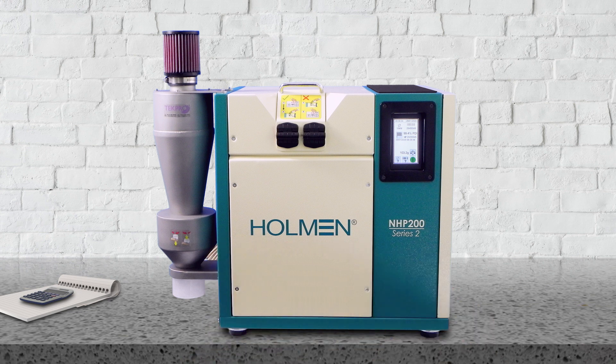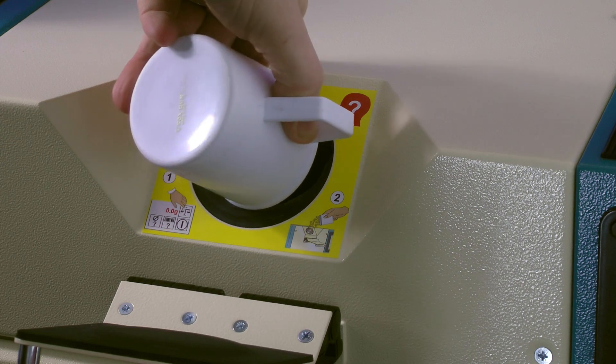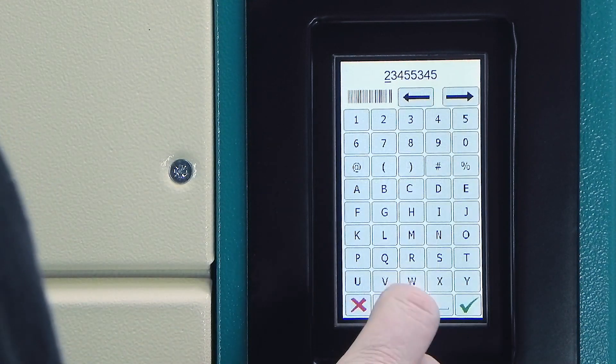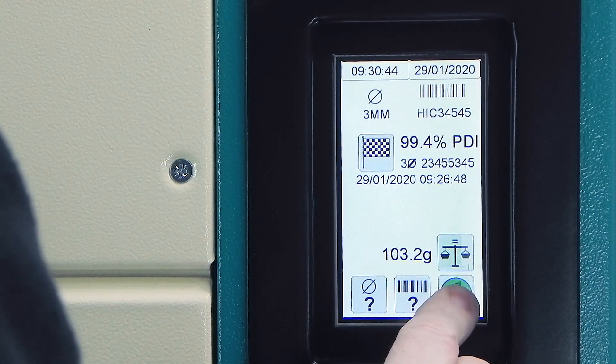The answer to improved test consistency is the Holman NHP200 Series 2. Your staff simply need to load the pellet sample into the machine. It automatically pre-weighs the sample. They then set the pellet size and add the test ID number. After this, everything else is automated to ensure test consistency.